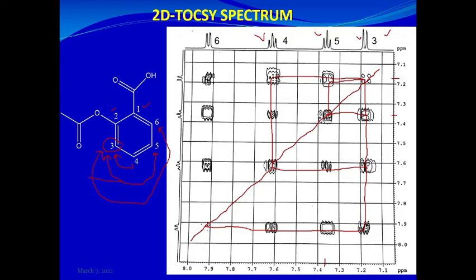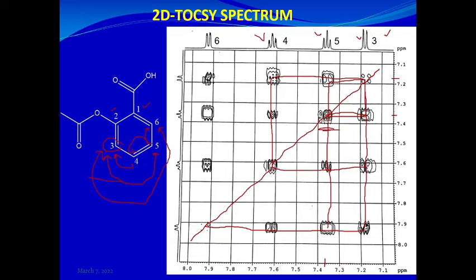Now let's look at the proton at 7.35, which is H5. We can assume it will show correlations with H6, H4, and H3. Going down the spectrum, it meets 7.62, which is H4 — a vicinal coupling. Continuing down, it meets 7.92, which is H6 — another vicinal coupling. And it also correlates with 7.16, which is H3, giving a meta-coupling or long-range correlation. So all the protons in the spin system are visible with a sufficiently long mixing period.